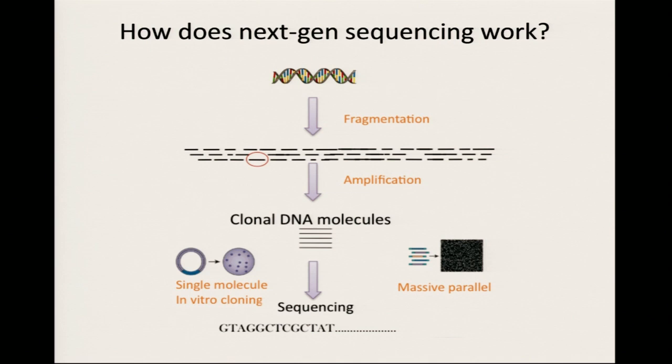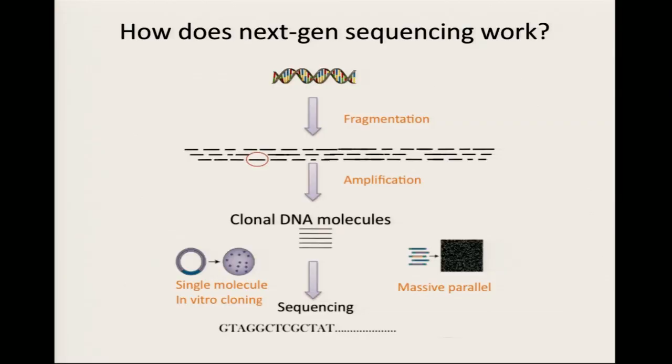You chop it up into a bunch of random little pieces. You take this big thing, 3 billion base pairs long, and you chop it up into these tiny random things, maybe like 300 base pairs or so. They could be different sizes, but they're not anything like 3 billion base pairs. They're much smaller, very small, random, and all over the place. They could be overlapping. You don't know where they come from. They're just random little windows into your DNA, right?